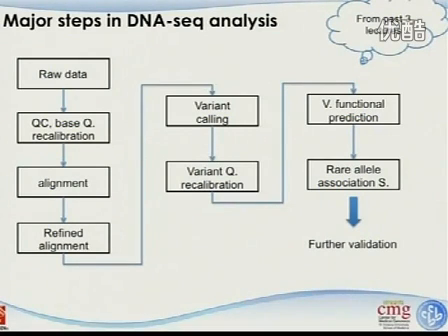And next, you will do the alignment part, which we also talked about extensively in the second lecture, and which we'll briefly touch base on a little bit today as well. And we mentioned the importance of the refined alignment. Keep in mind that the initial alignment, most of those short-read aligners, are not doing very well in the insertion deletion regions. So sometimes they really give you false positive or false negative alignment there.